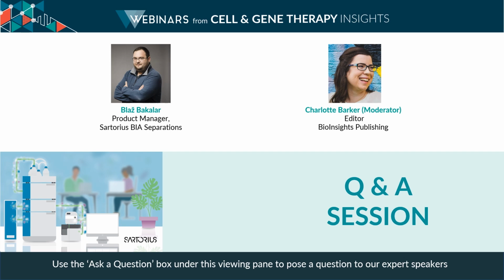Perfect, thank you. Lots of great questions coming in. So next one here, how do you detect the difference between double-stranded RNA, hairpin, and DNA? Really very difficult. With great difficulty.